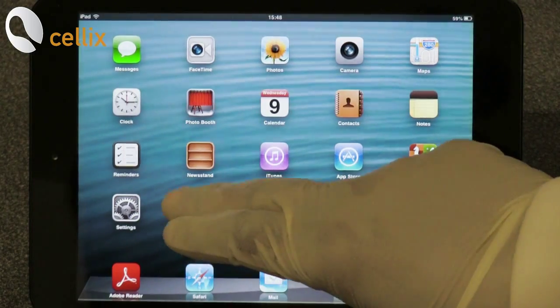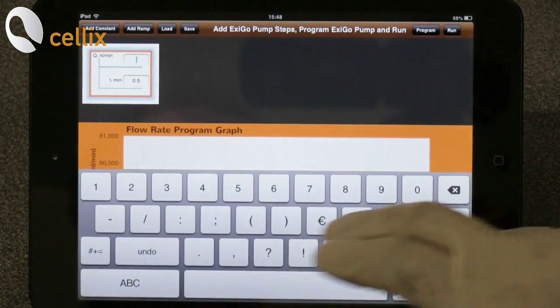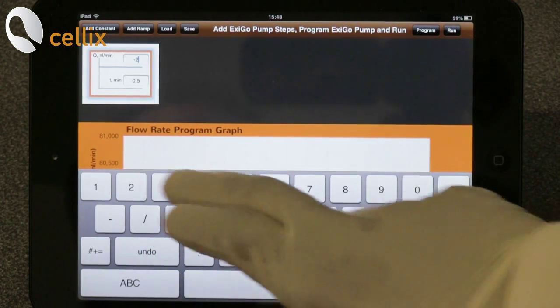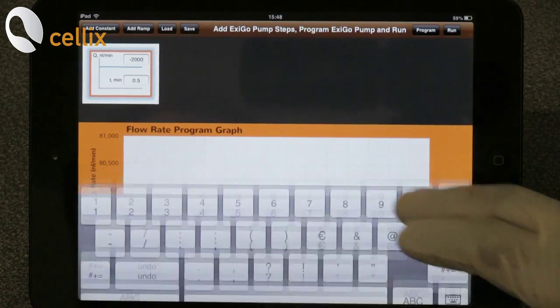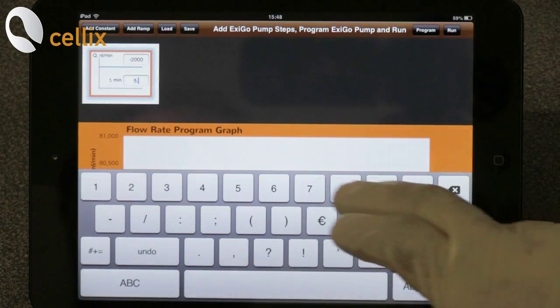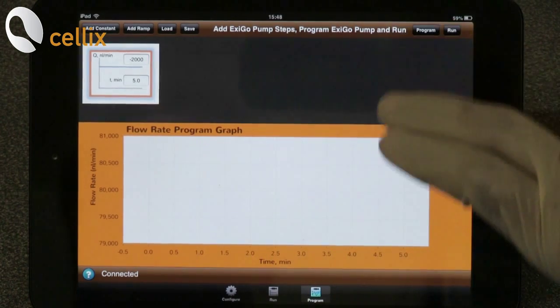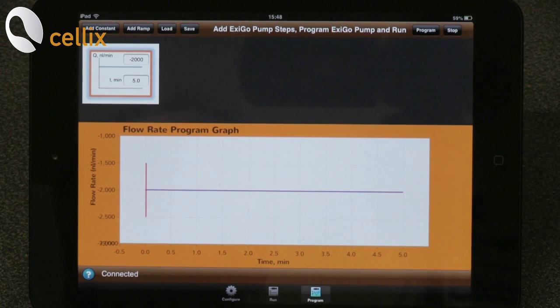Go to the app, click the flow rate, and set it to minus 2,000 nanoliters per minute since you are pulling the sample. Click done, set a time of 5 minutes, click done, click program, and run the assay.